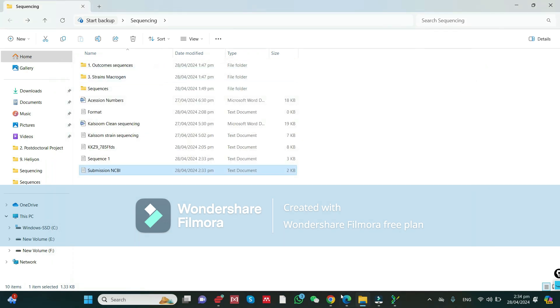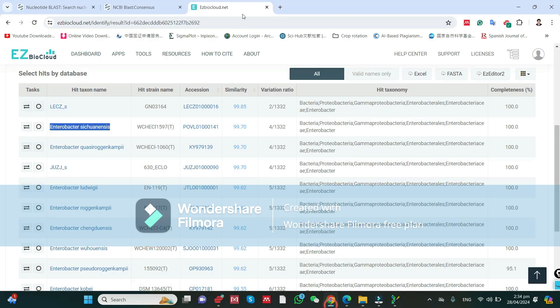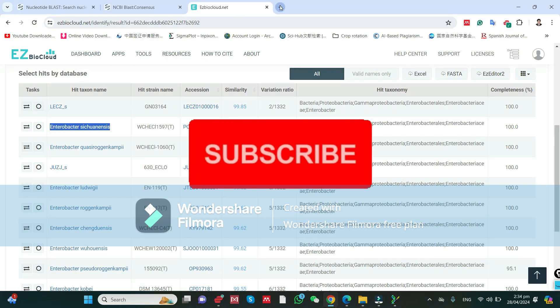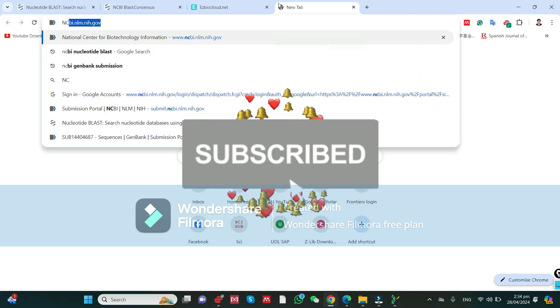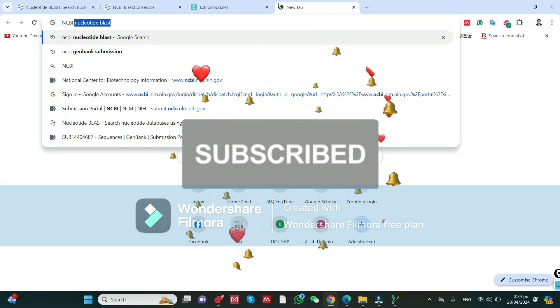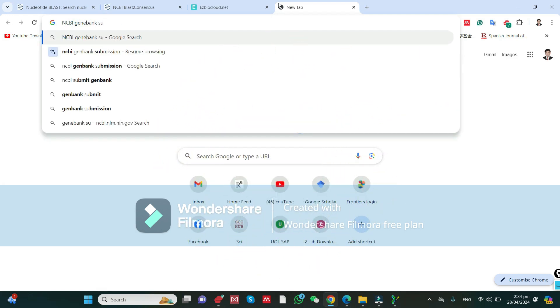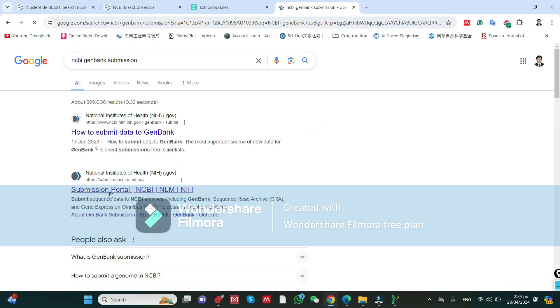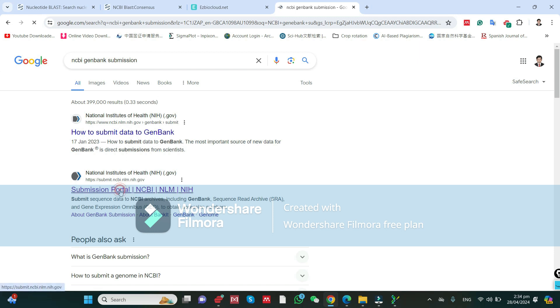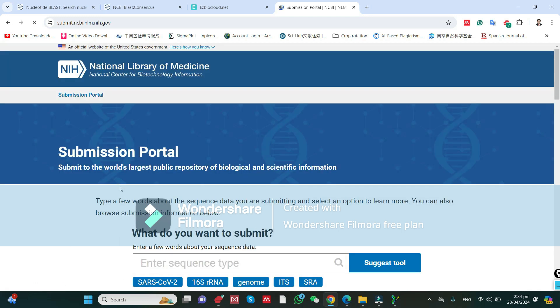Go to the browser and navigate to NCBI GenBank. It will show the submission portal and instructions on how you can submit. All the instructions are there.